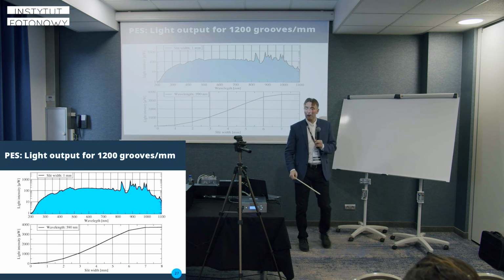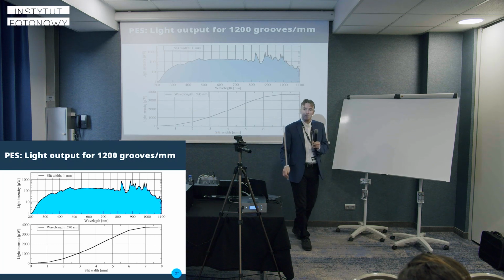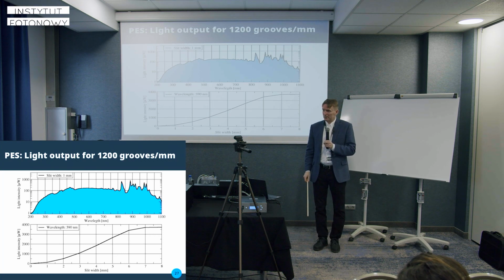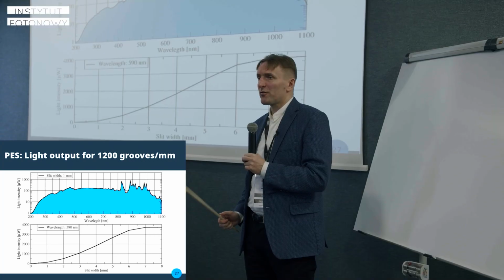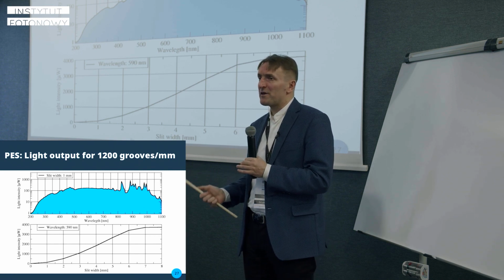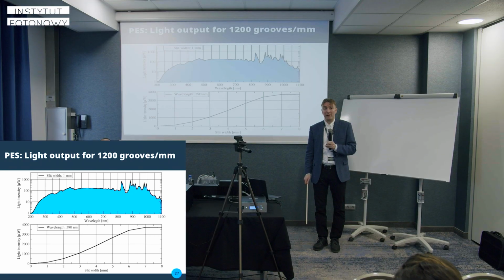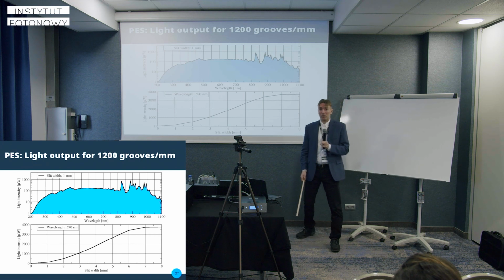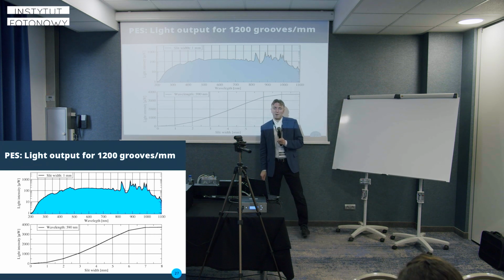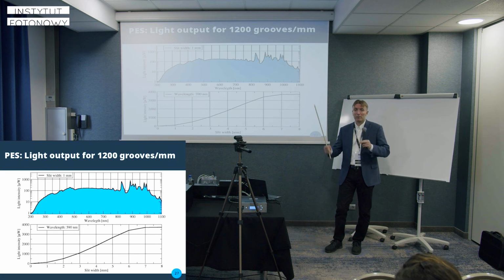And typically for 1 millimeter slit openings, we use gratings that have 1200 grooves per millimeter, and that turns into the dispersion of this monochromator, which is around 4 nanometers per 1 millimeter of slit opening. So if you open the slit to 2 millimeters, you can expect this number to double. So it will be 8 nanometers of the half width of the light going to the sample.